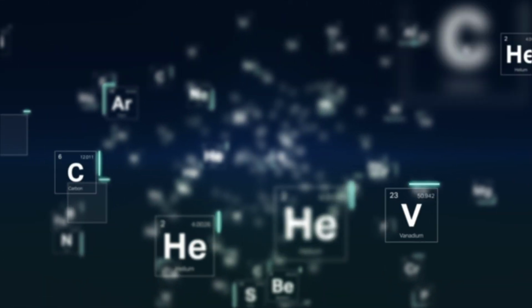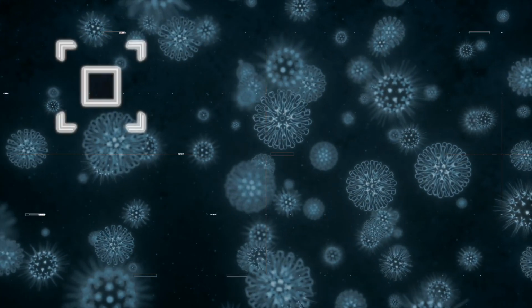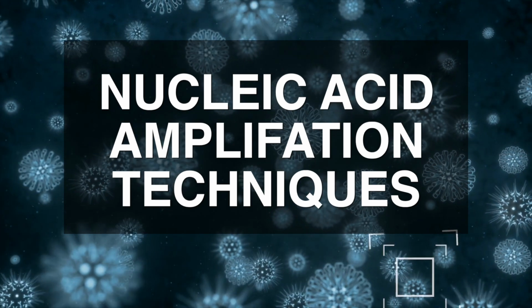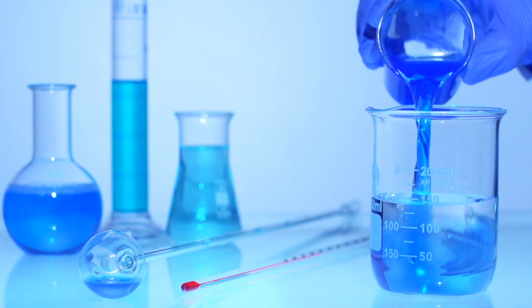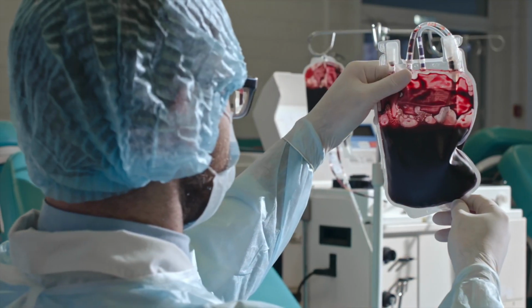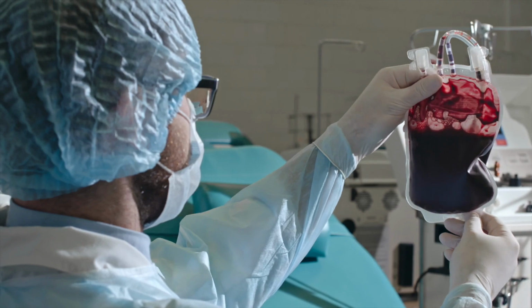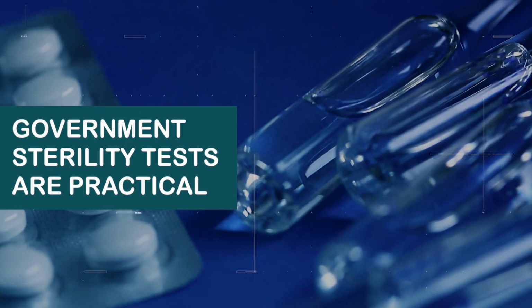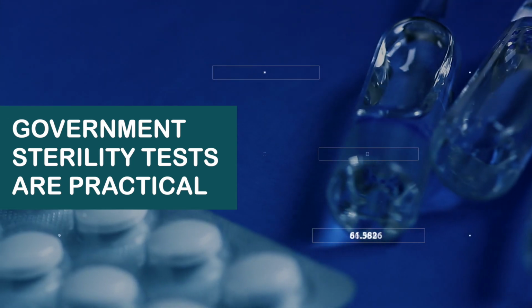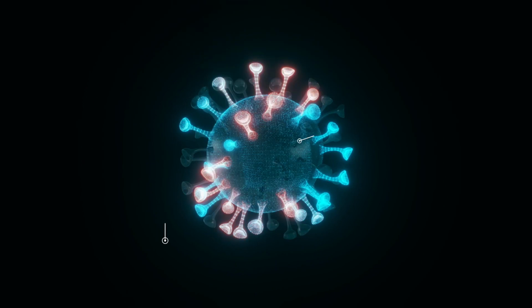There are many types of government sterility tests that can detect contamination, but nucleic acid amplification techniques can even screen for viruses. This newer method, combined with previous detection methods, has a high probability of ensuring pharmaceutical products are free from microbial bacteria contamination. Government sterility tests are practical because they can be used in direct contact with medical devices during the incubation period to help test for the presence of microorganisms.